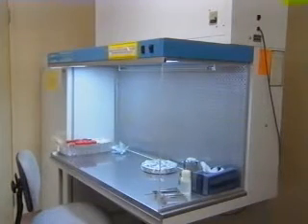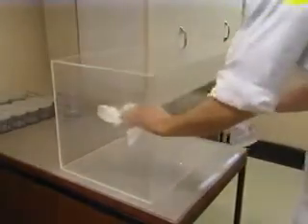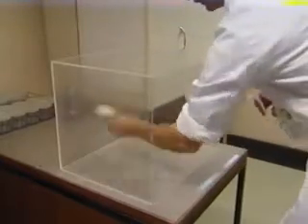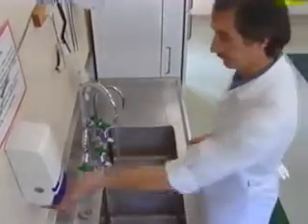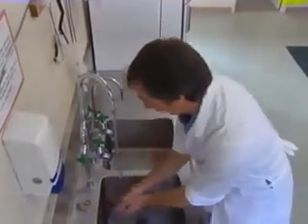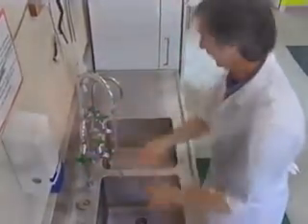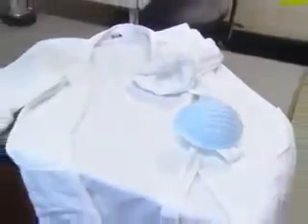Now, if you do not have a laminar flow cabinet, a fish tank on its side, like this one, which has been swabbed and sprayed with alcohol, would do just fine. But you have to bear in mind that for a commercial lab, these will not be sufficient. The operator should also be cleaned up, hair tied back, jewelry removed, hands washed and surface sterilized using either 70% alcohol or other compounds such as hexafoam. A clean lab coat and a face mask will reduce chances of accidental contamination.